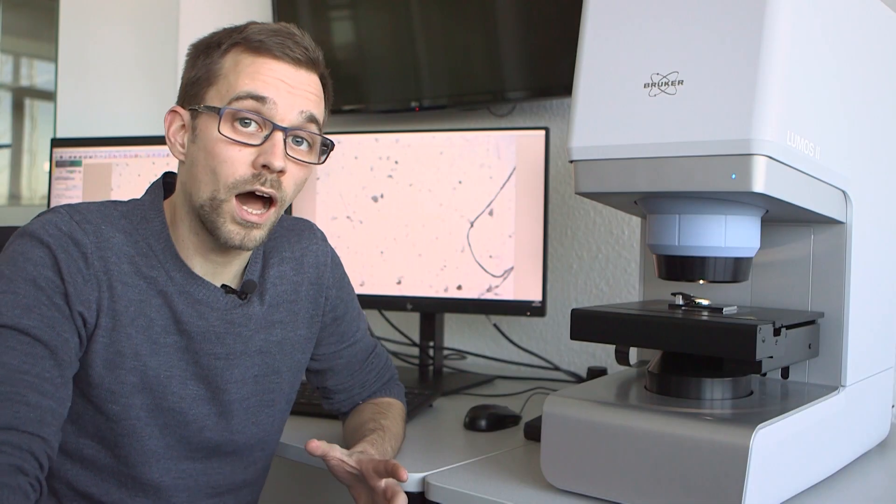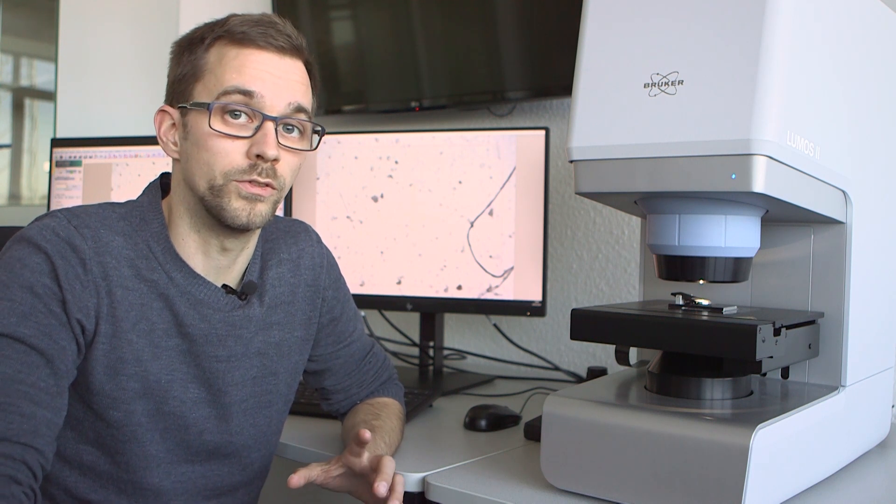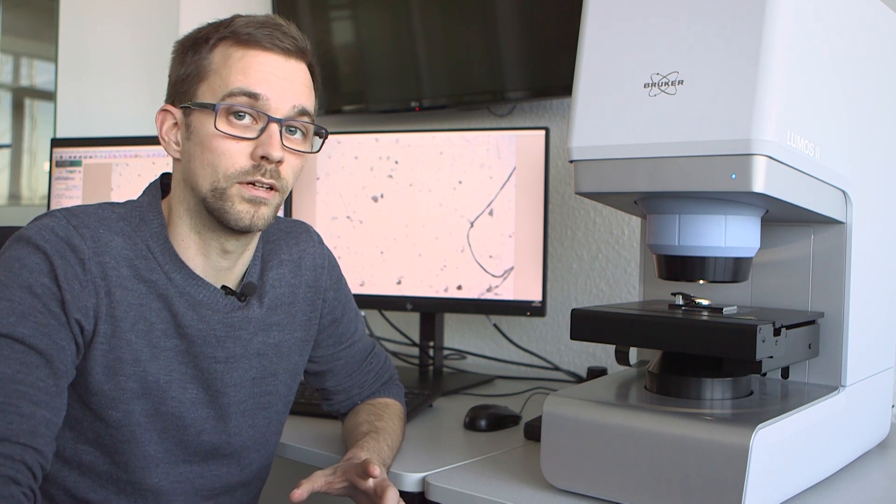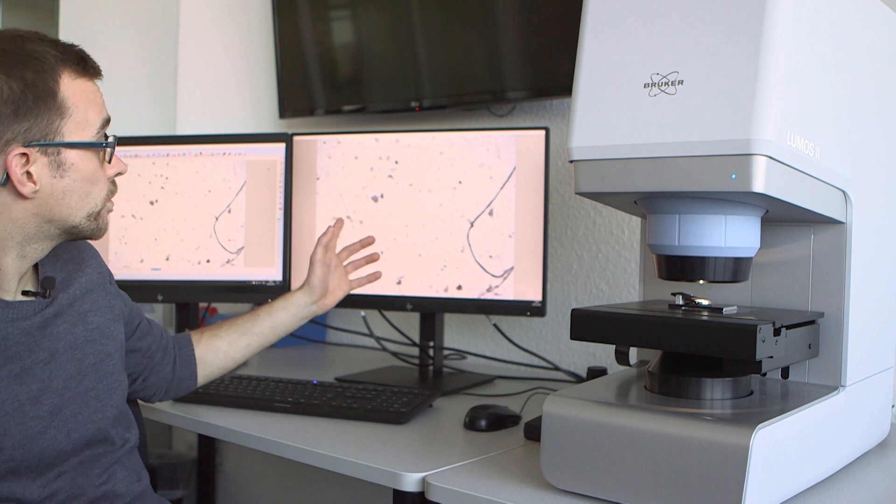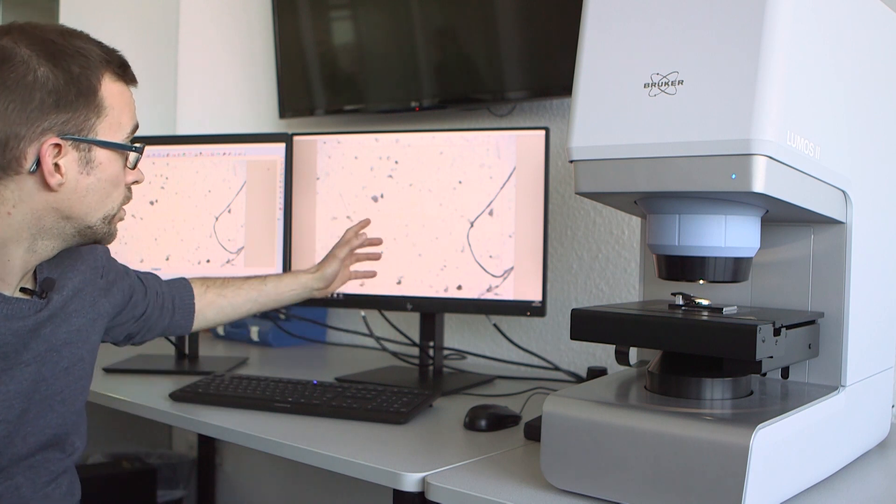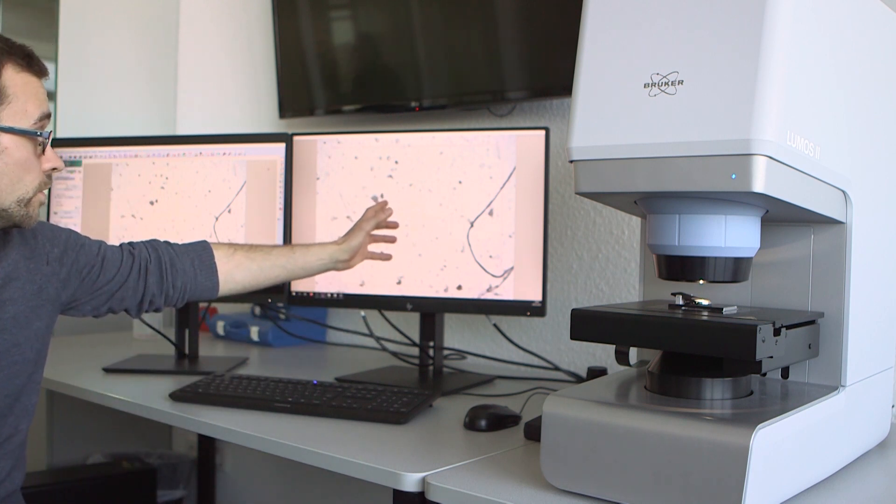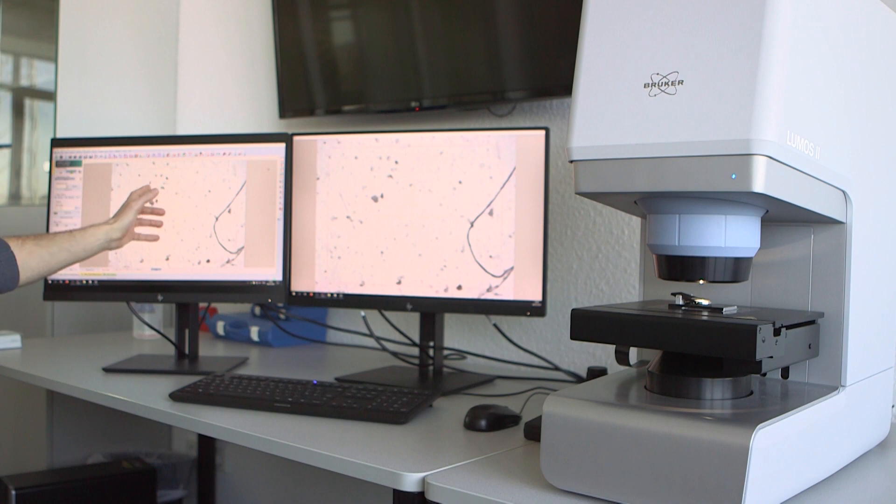In FTIR microscopy, it's very important to always have a good view of your sample. This is why we're using this dual monitor setup, where you always see your sample on this screen and where you do the workflow on the other screen.